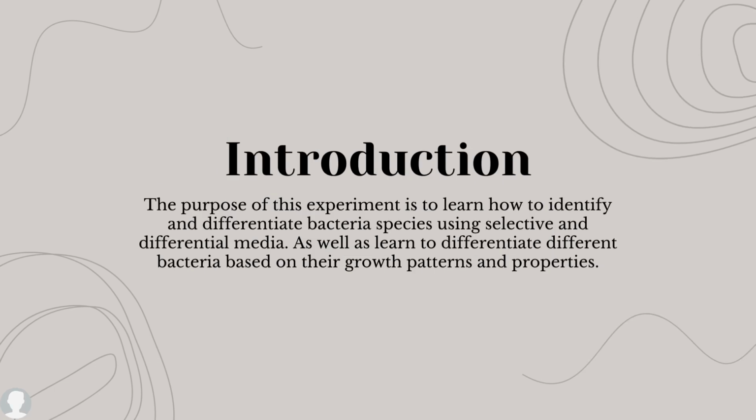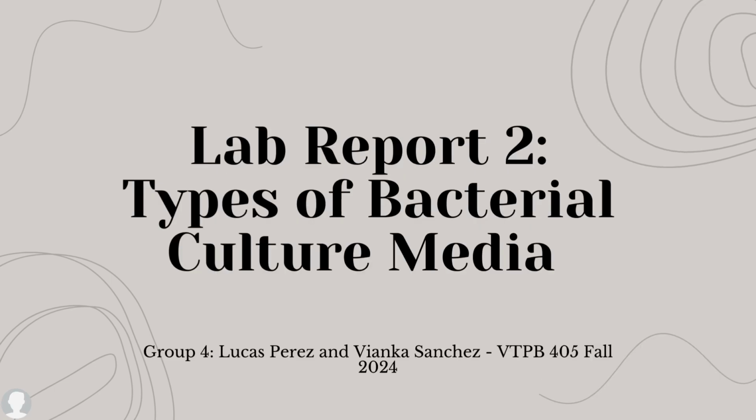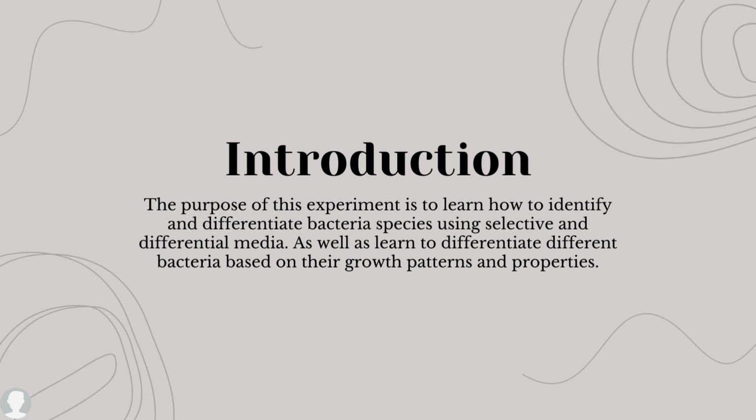This is Group 4's Lab Report 2 on types of bacteria culture media by Lucas Perez and Vianka Sanchez. The purpose of this experiment is to learn how to identify and differentiate bacteria using selective and differential media, as well as learn to differentiate different bacteria based on their growth patterns and properties.